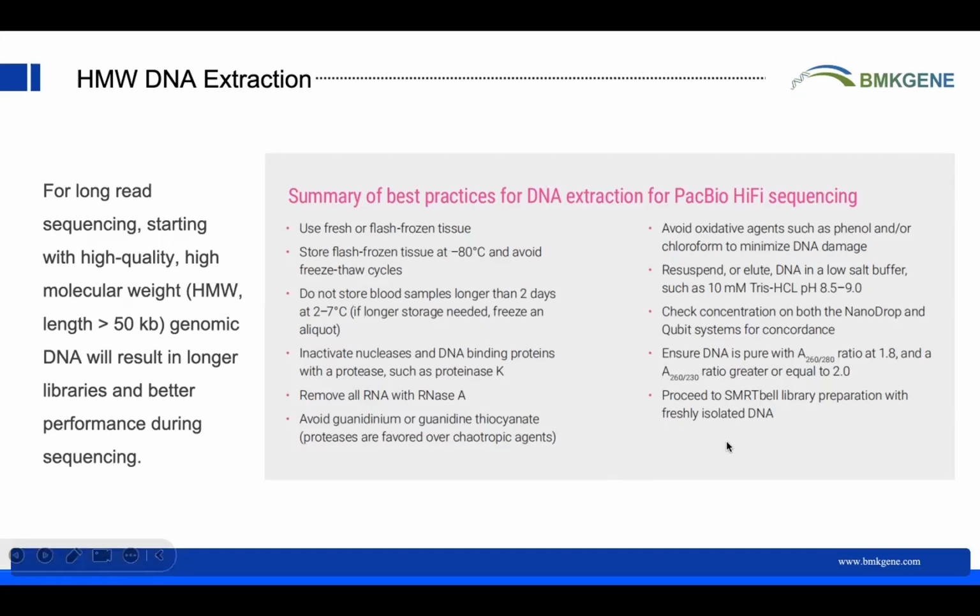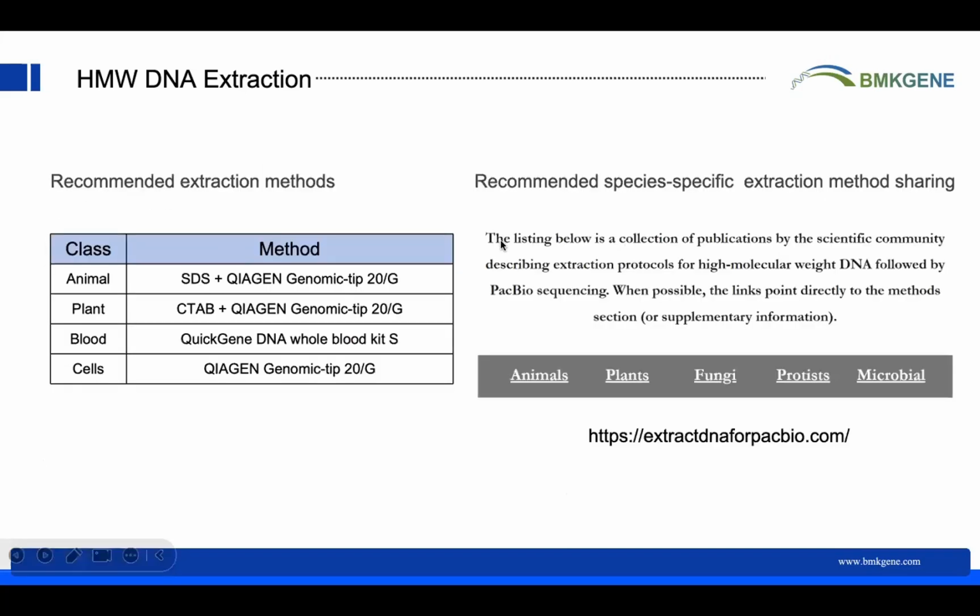And also, after the extraction, you'd better test the DNA quality, like the purity, the concentration, and the total amount, to see whether it could reach the requirements of HiFi sequencing. Also here for you to refer to.